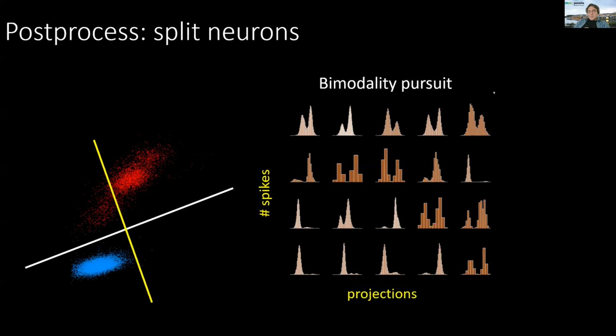Now, in the sleeping part itself, the same neurons are there, they're just firing at different firing rates. Kilosort won't have a problem with that. But if enough conditions are bad, like you're recording a short segment and there's a lot of changes in firing rates, then yes, sometimes you'll see things go completely out of bounds. Your estimate of drift will look very noisy and unrealistic, and you'll know right away that it's not working correctly.